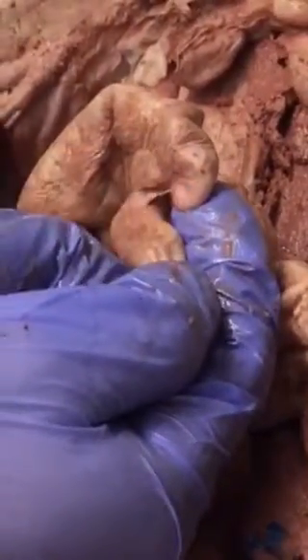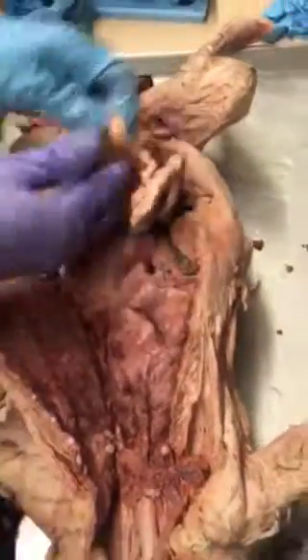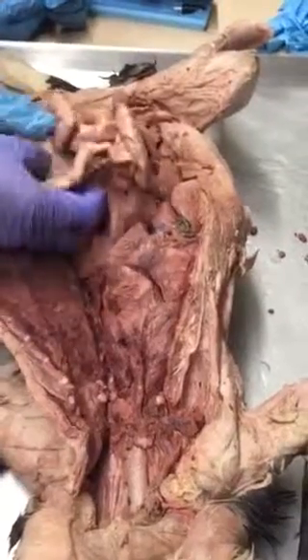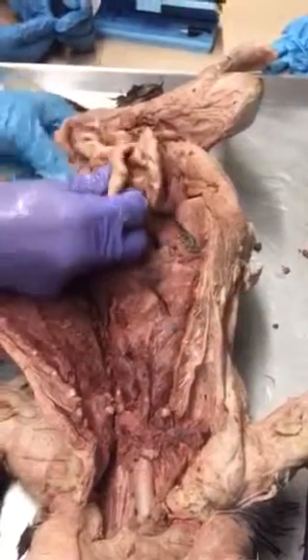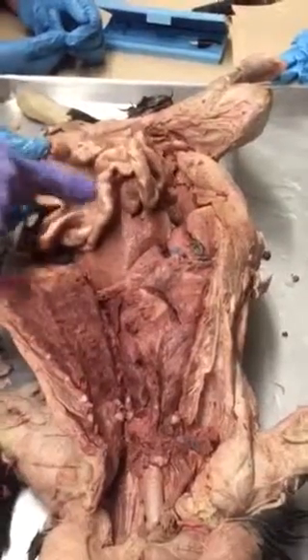So the cecum is the beginning of the large intestine. Now notice what is holding all of the intestinal tract together. It looks kind of like a flower.